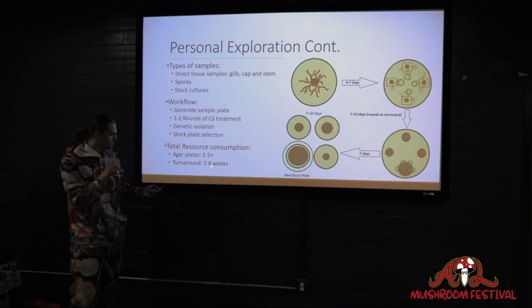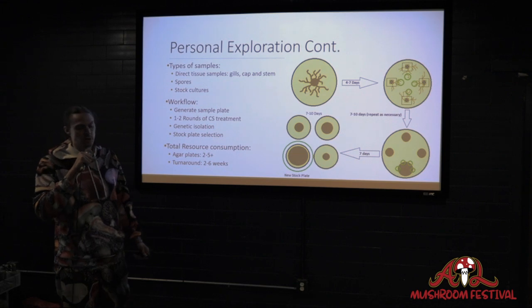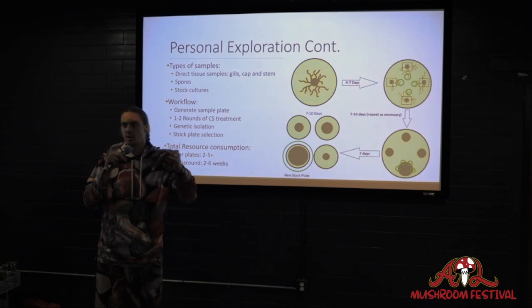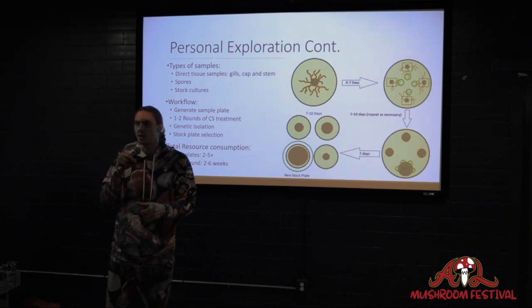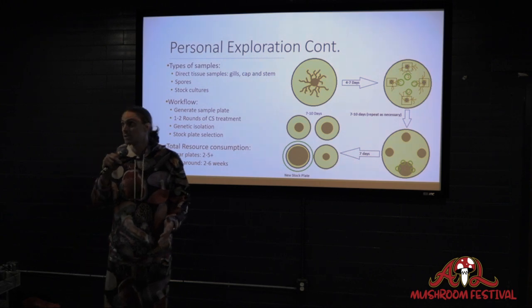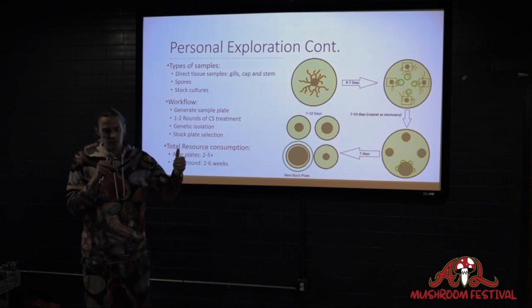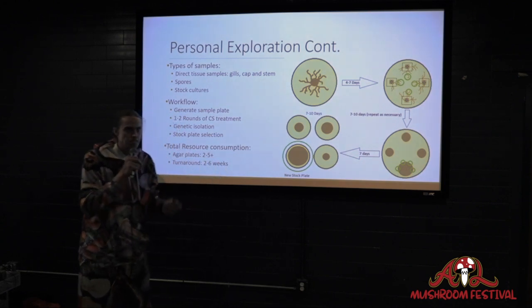And 2 to 6 weeks may not seem like a short amount of time, but consider trying to run away from contamination the old-fashioned way by just picking a clean piece, putting it on a plate, picking a clean piece, putting it on a plate. Every time you do that transfer, you're waiting 7 days. If you have 5 plates, that's 5 weeks. If you have 10 plates, that's 10 weeks, right? So the numbers keep going up the more plates you're trying to transfer from, and guess what? Yeah, there's still a 97% chance it's still contaminated. Yep.